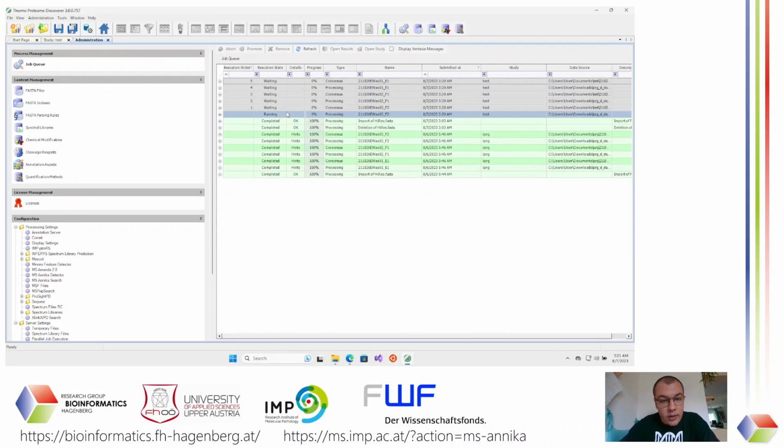We have fixed it in Proteome Discoverer 3.1, but that is currently not out yet. But as soon as that's out, it would probably be a good thing to change to that. If it happens, it usually happens just with specific kinds of fasta files that are formatted in a way that the identification or the accession ID is not completely clear and is ambiguous. Then it might give you that warning. But as I said, you can just ignore that if it happens, and everything will work fine.